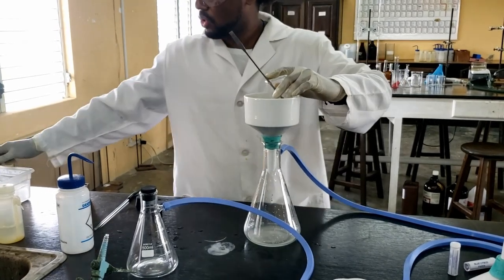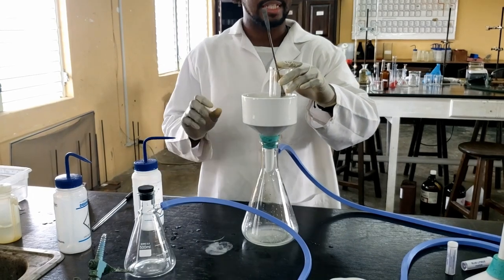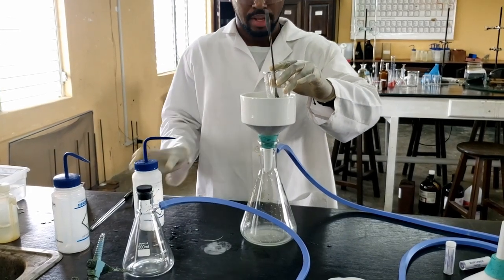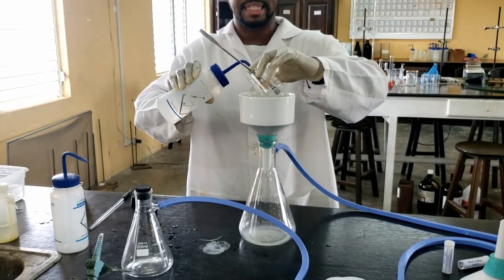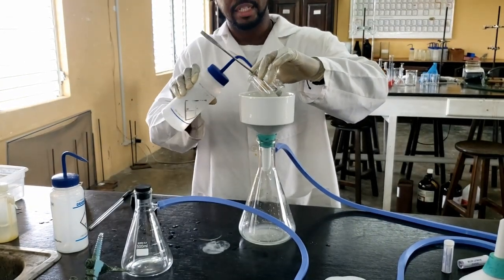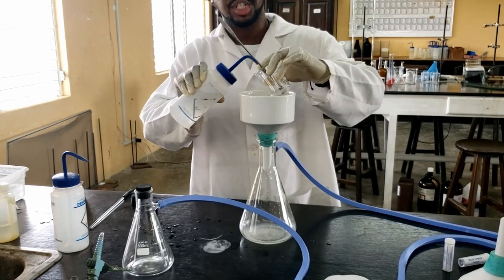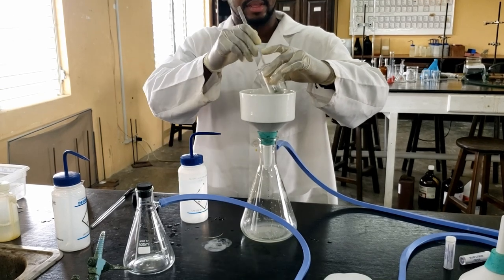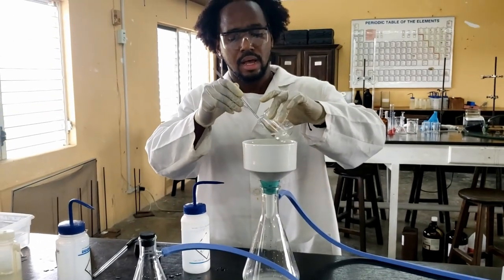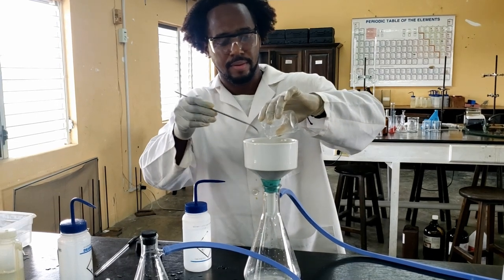We'll go through adding cold water, and in between steps we're going to test with blue litmus paper the solution that's dropping off to see if it's still acidic. Remember, we used concentrated sulfuric and nitric acid, so we want to wash away all of that acid, to make sure it's safe enough for us to move on to the next step.